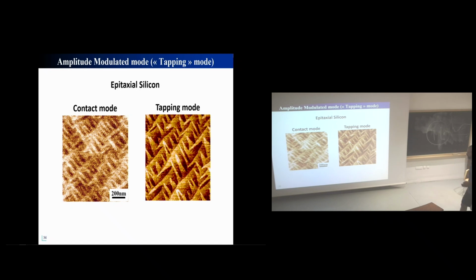Okay? So this is one of the first examples to compare what you can do on these things, epitaxial silicon with contact mode and tapping mode. Okay, no comment.